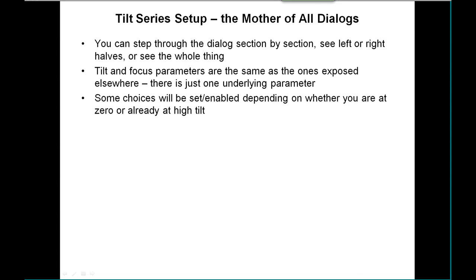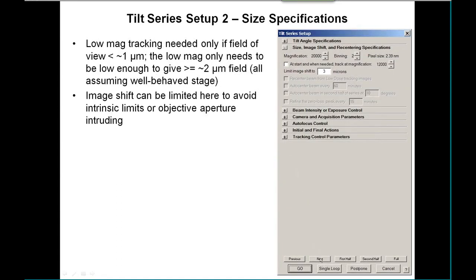The tilt series dialogue is huge, and you have choices about how you can look at it. You can look at the whole thing, the left or right sides, or step through it one section after another. Some of the parameters exposed there, particularly the tilt interval and the focus parameters, are the same as the ones you can see and set in other places — there's just one underlying parameter until you start setting up multiple tilt series. Depending on whether you're at zero tilt or high tilt when you open the dialogue, things will be enabled or disabled in intelligent ways.